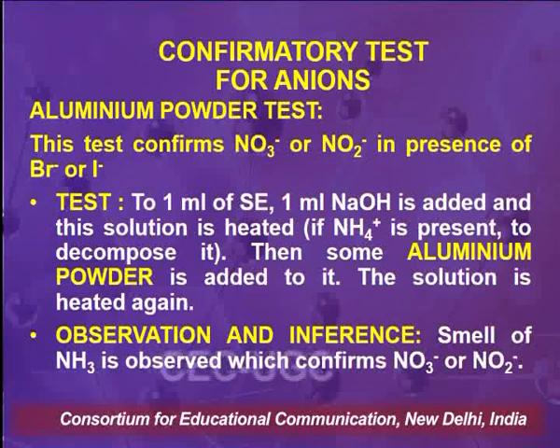So, the smell of ammonia confirms either nitrate or nitrite, and the brown fumes which we have got an indication earlier are due to nitrate or nitrite and not due to bromide or iodide, as in this case.